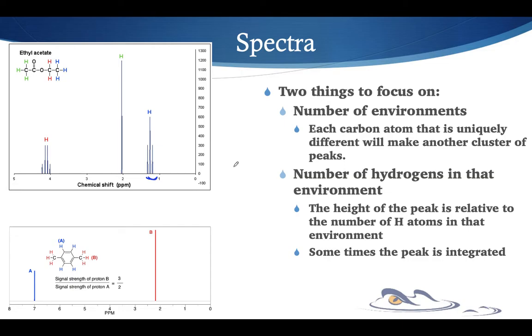And they go look at tables to try to figure out what this shift of 1.2 is. I'm going to tell you that's not what you want to do. In fact, if you have tables that are telling you this stuff, you need to just ignore those. You don't need the tables to tell you about these carbon environments. Trust me, they are far more complicated than that.